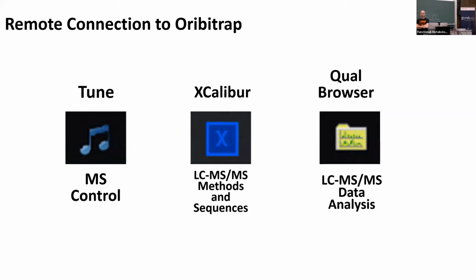I'm remotely connected here to the computer in the lab, and I can control the machine from here. I already put the samples in the autosampler, and I put in the right column. That's something I had to do during the lunch break before, and you may have to do as well, but most of the work is on the computer. If some of you are interested, I'm happy to show you around, how the machine looks and where to change the column and so on.